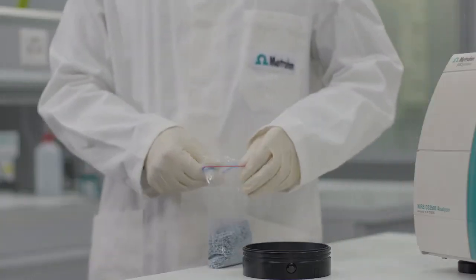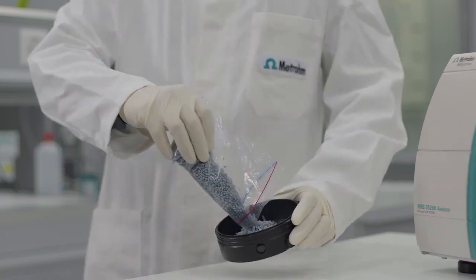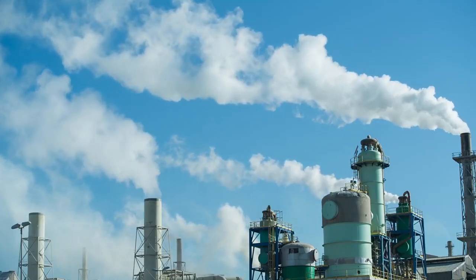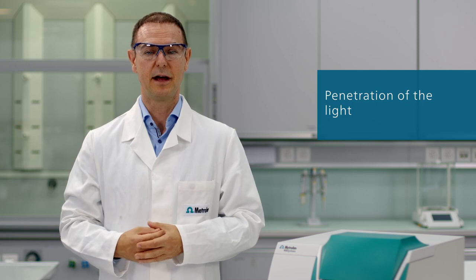Conversely, the absorption of near-infrared light is much weaker and samples can be measured as is, without any sample preparation needed. In addition, longer path lengths can be used when measuring liquid samples with NIR spectroscopy. This is especially useful for online measurements in industrial process environment. Now for the second difference between IR and NIR spectroscopy, the sample penetration by the light.